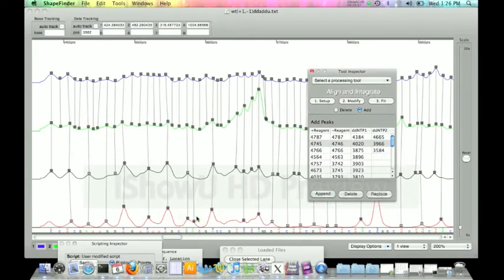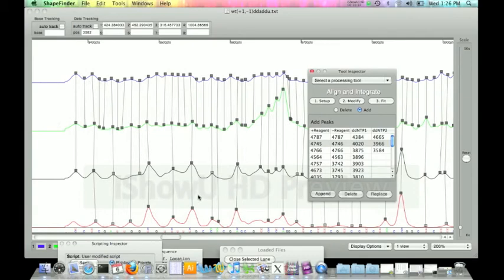Just confirm that in. Now we see that our data is looking pretty good through here. Towards the tails, it might get a little fuzzy, but you really can still get good peaks, just making sure that you line up your sequence correctly. So you really want to go through in here and just take out some of the spacing, maybe add some peaks, play around a little, just to see what you can get to line up. I'm saying, all right, this isn't too bad, but I'm going to go ahead and keep dropping a couple peaks in just to play around with it and see how it looks.